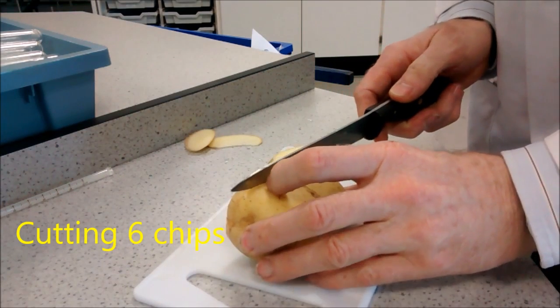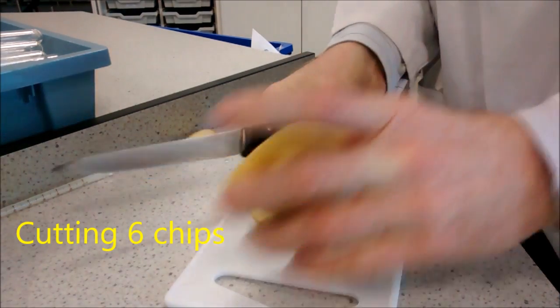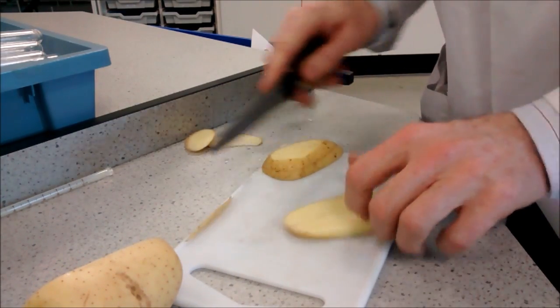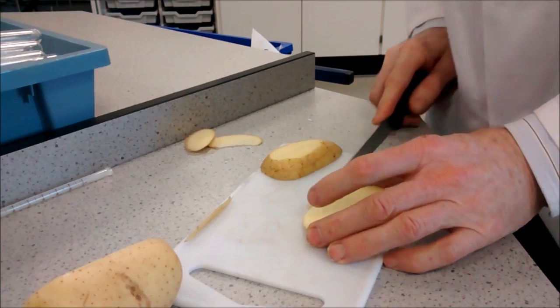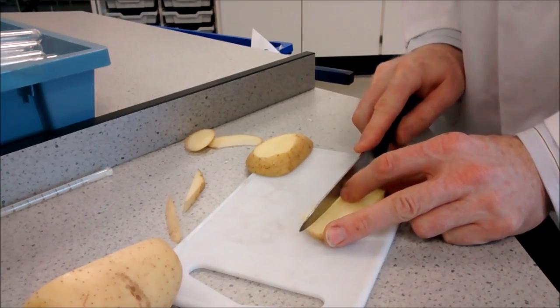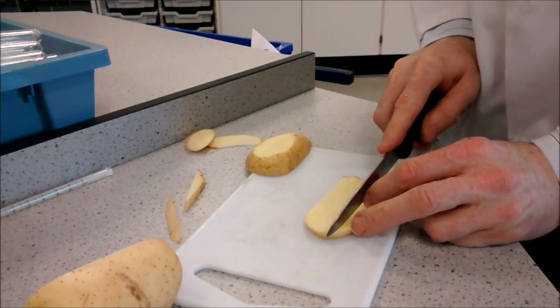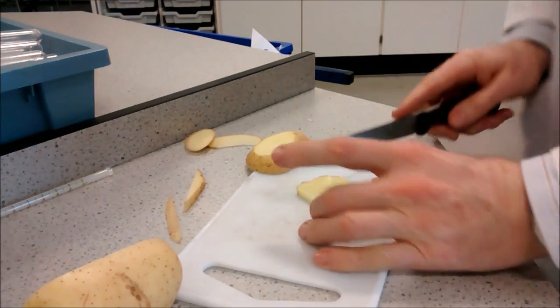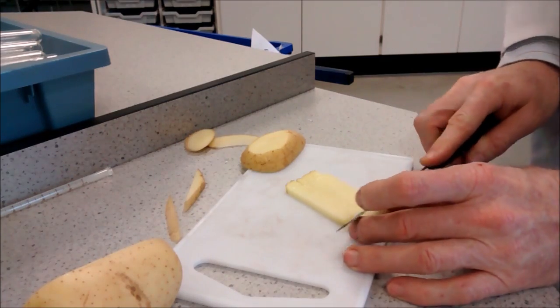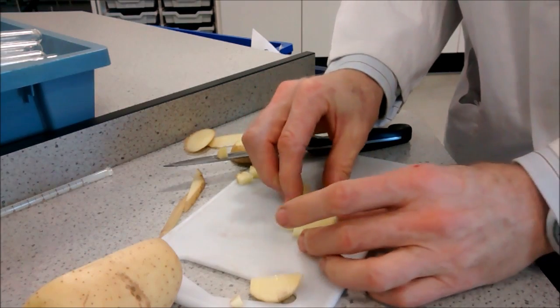Cut chips by first cutting a thin slice of potato, then slice off the skin and cut nice even chips. One, two, three, four, five, six. Get them all to the same length and there we've got six chips.